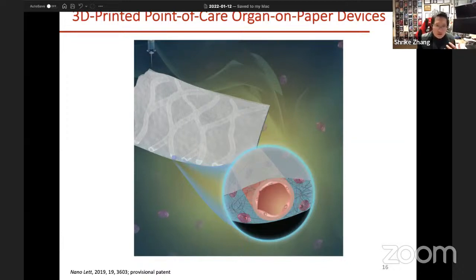For the original materials. And then another advantage there is that once you have the paper device in the dry state, it can be stored for pretty much as long as you want, right? So then with that, can you actually combine paper devices with these sacrificial bioprinting techniques and allow that to happen?